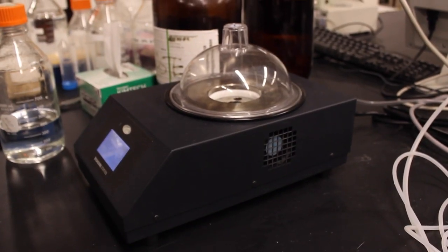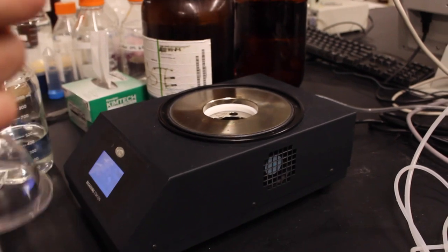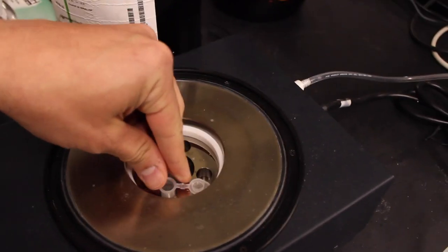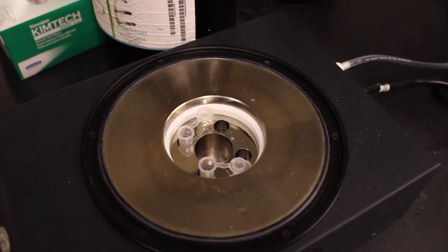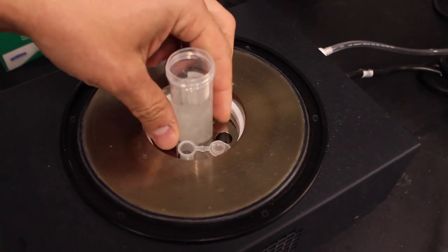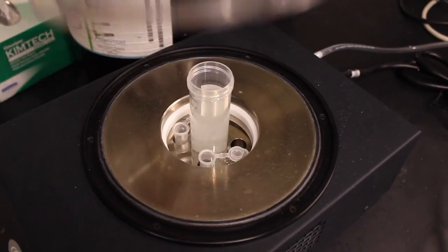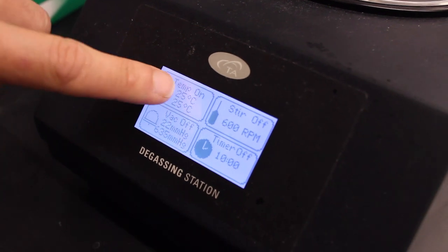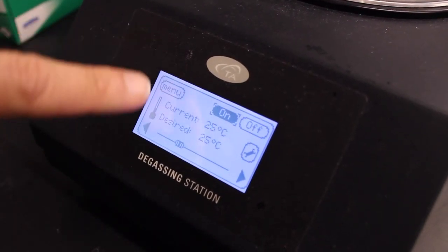To use the degassing station, you would put your samples into these wells here so you can put small eppendorfs into the side wells and if you want to put a larger tube, you can put that into the center well. If you're running at a temperature different than room temperature, on the menu you can set the temperature. Currently we're going to just run at 25 degrees.